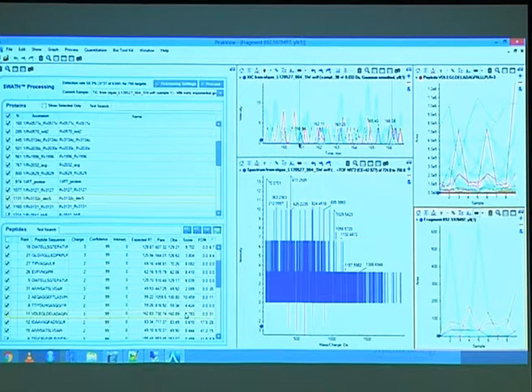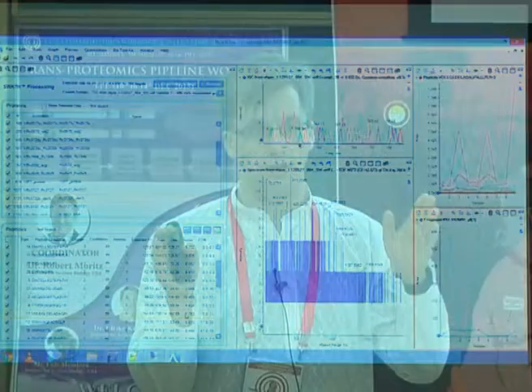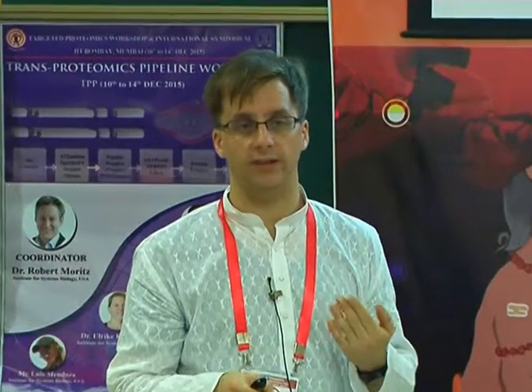So that's not okay. The reason why that happened is that PeakView specifically, I'm not exactly sure about the other softwares, only looks at the decoys around that identified assay. So in that case, it would take that one and take, again, a retention time window around it, and only look at the decoys that are identified there.